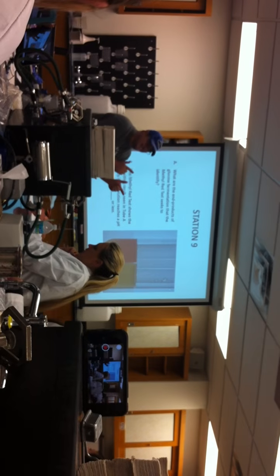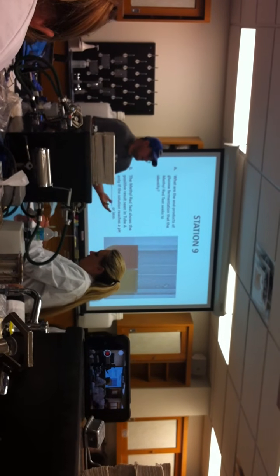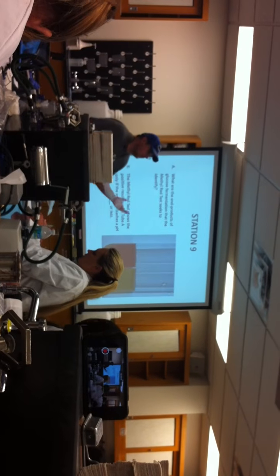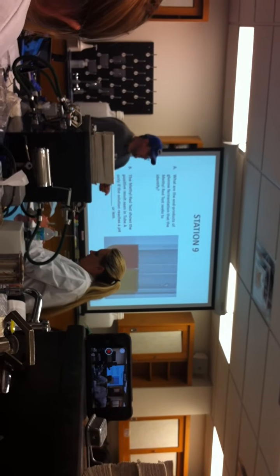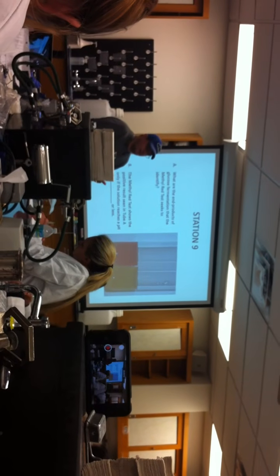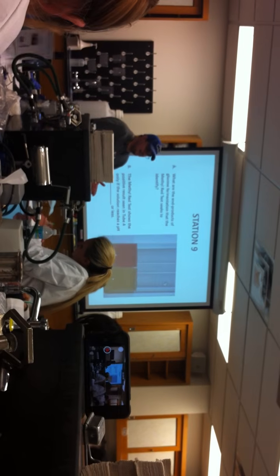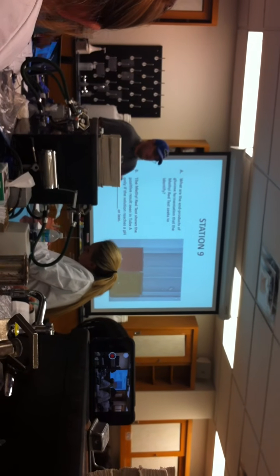What is the other one? It's either acidic byproducts or neutral byproducts. Voges-Proskauer tests for neutral byproducts of fermentation. That means the bacteria don't like acid, so they make acid in fermentation and then they destroy it. Okay?